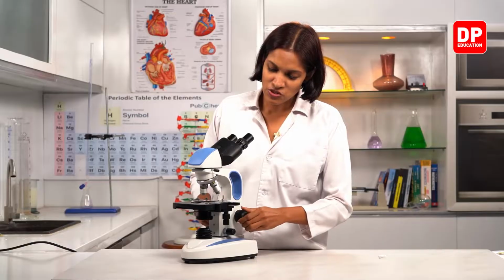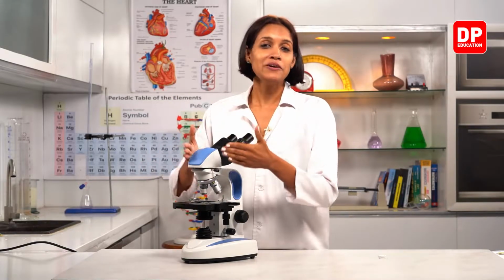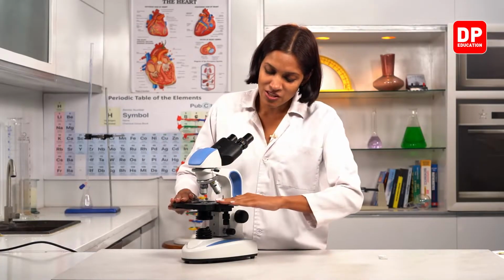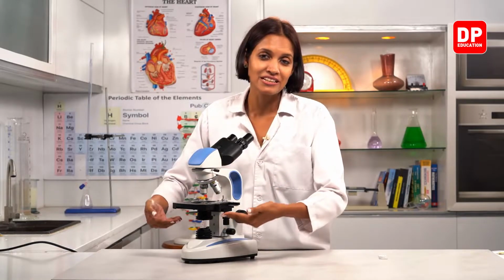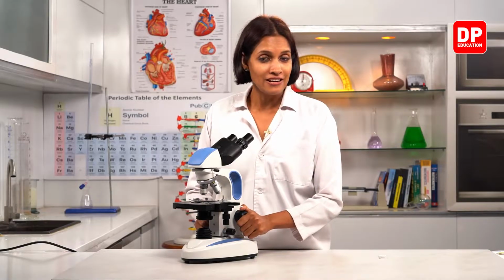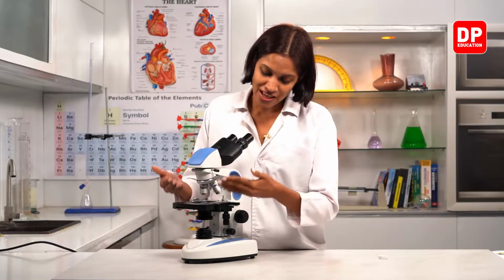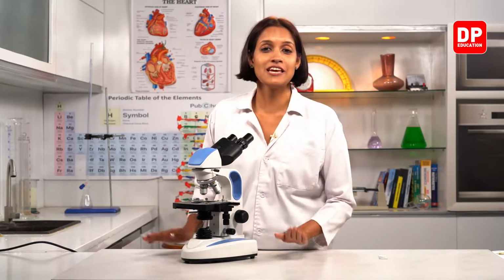When we rotate this one, this body tube moves up and down. Okay? Either way, the distance between the stage and the objective lens can be increased and decreased by rotating this big knob. Right? By rotating the coarse adjustment knob, we can change the distance between the objective lenses and the stage.